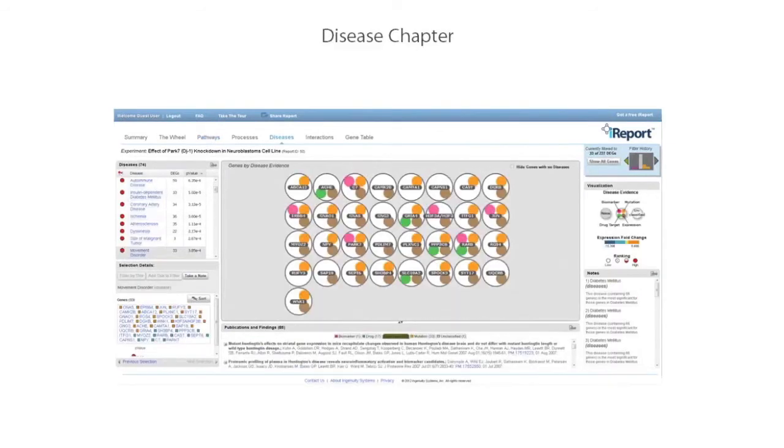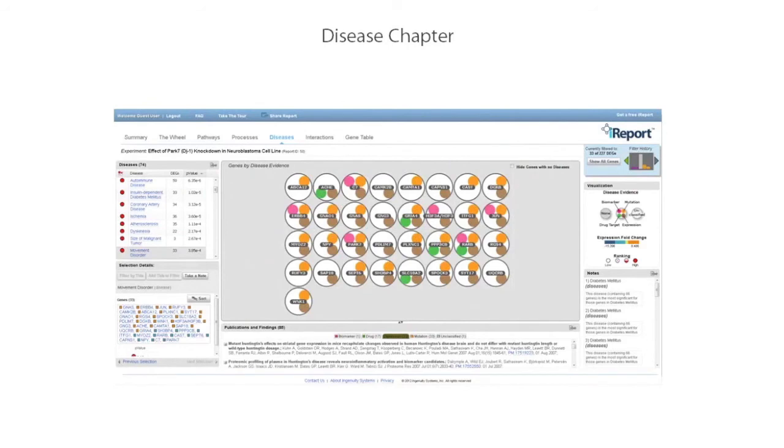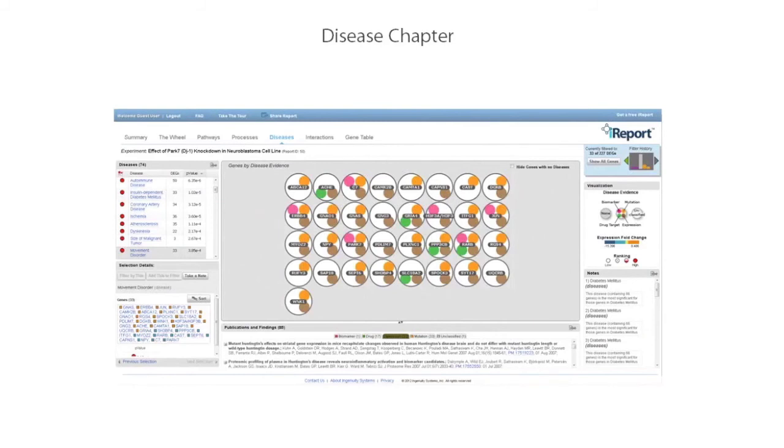The disease chapter helps you identify the diseases most significantly associated with your set of genes. In the main area, genes are visualized based on the evidence that implicates them in a disease. You can use the color coding to quickly see which are known biomarkers, which are mutated in the context of a disease, which have altered gene or protein levels in the context of a disease, and which are the target of a drug that treats the disease. Visualizing in this way helps you understand the context in which your differentially expressed genes have already been studied.